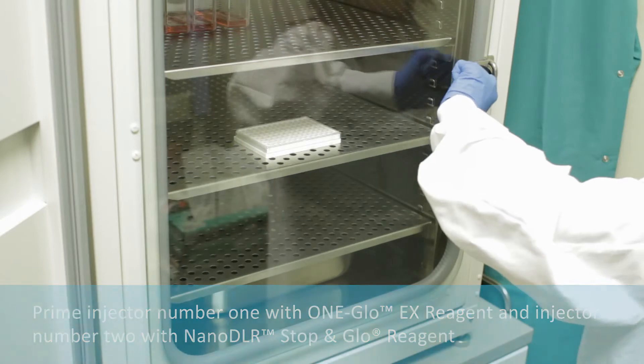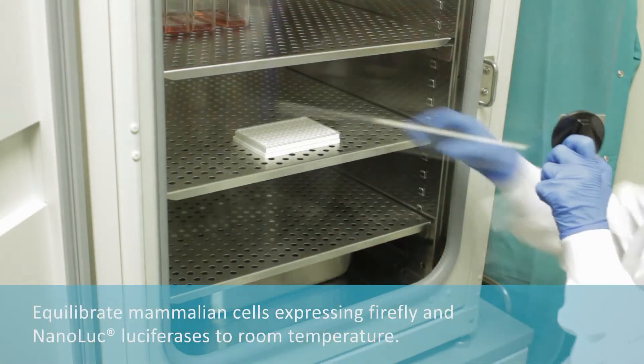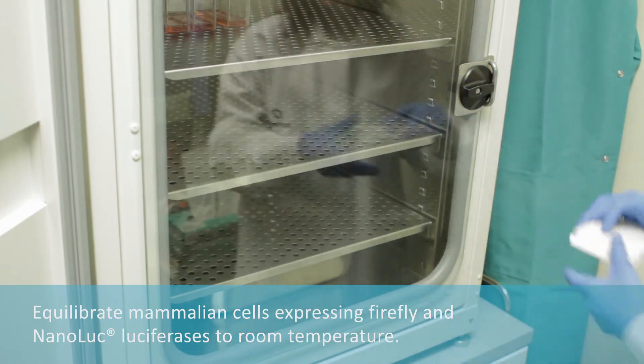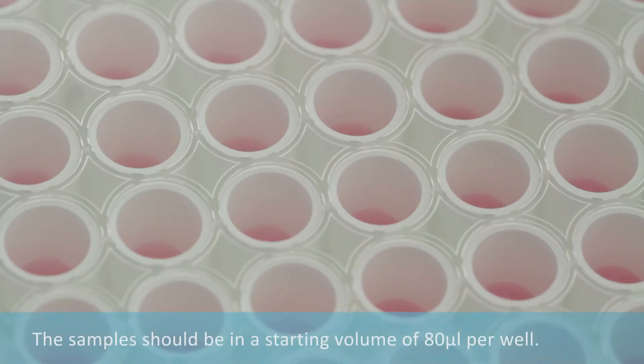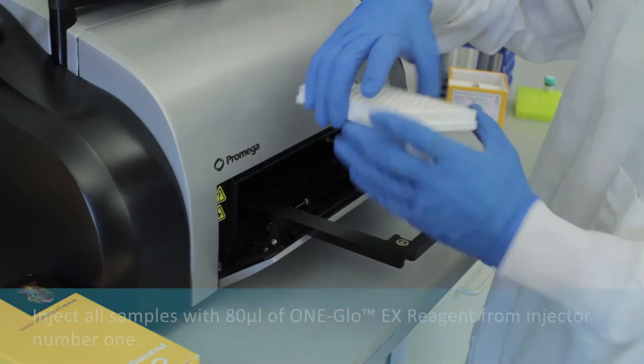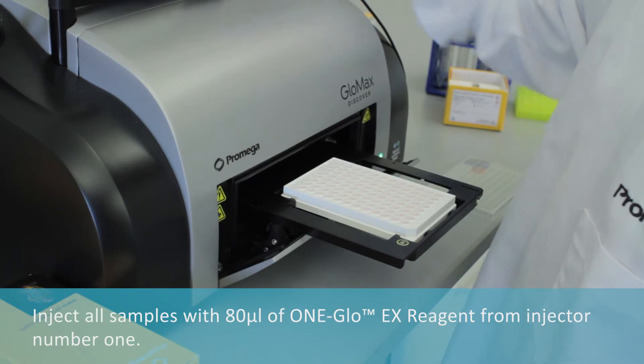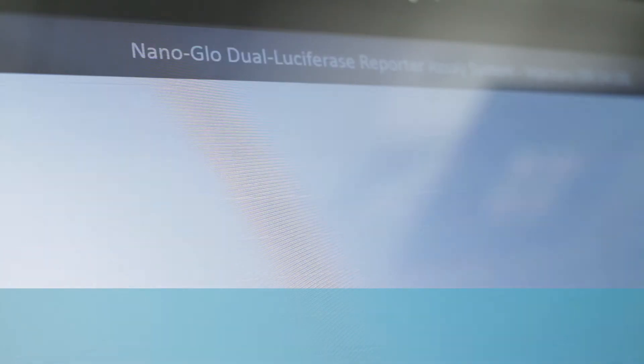Prime injector number one with One-Glo EX reagent and injector number two with Nano DLR Stop-and-Glow reagent. Equilibrate mammalian cells expressing firefly and NanoLuc luciferases to room temperature. The samples should be in a starting volume of 80 microliters per well.